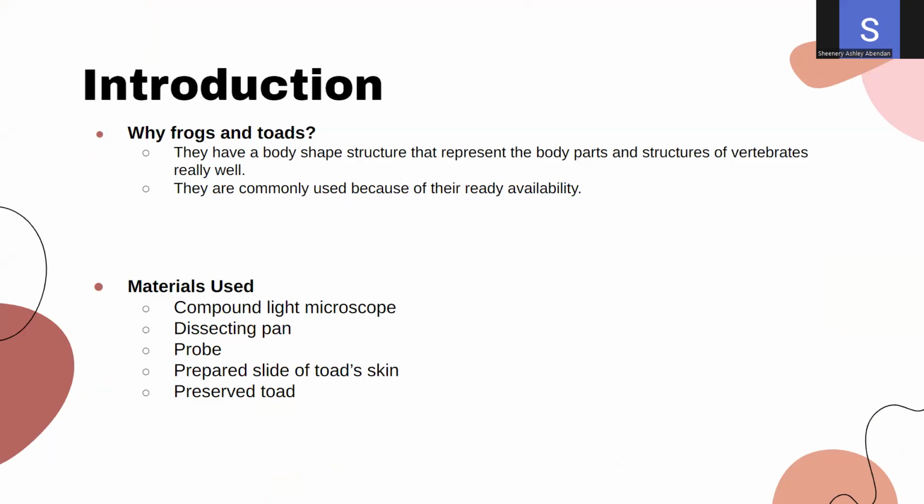Materials: compound light microscope, dissecting pan, probe, prepared slide of toad skin, and preserved toad.